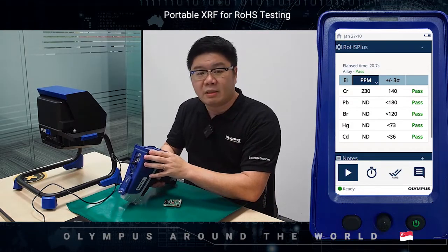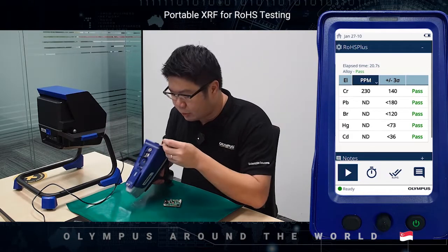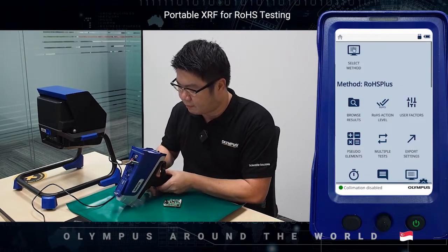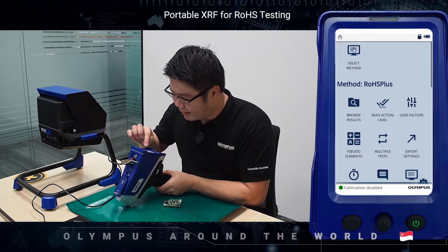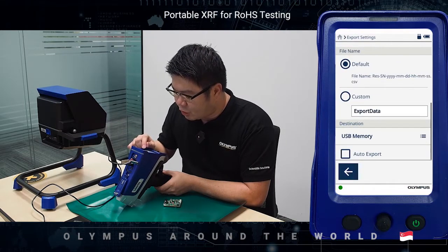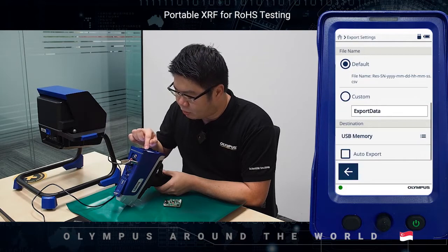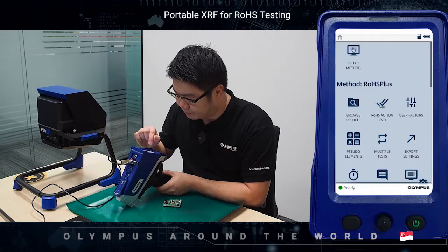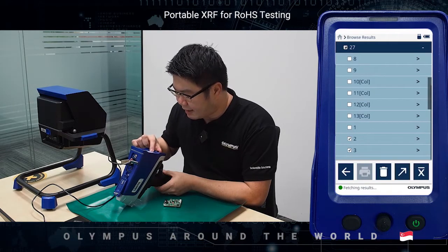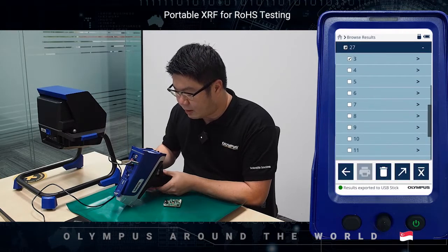Once the result has been completed, all you need to do is take a USB flash drive and put it into the USB port in the Vanta. Go to the export setting, and under destination make sure USB memory is chosen. Then go back, go to browse results, select the results that you would like to export, and simply tap on the export button to export the data into the USB flash drive.